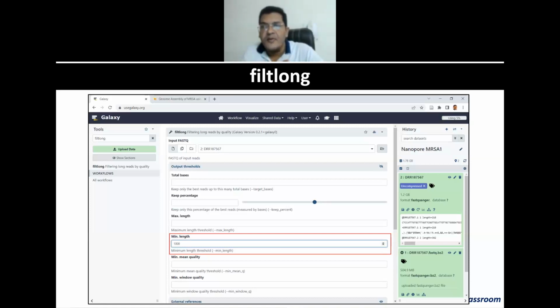But yes, you can look at other examples. You'll be able to see how to upload paired end reads. These anyways would come as two separate files, but you can link them together saying that these two files are from the same fragment. So that then the analysis also gets different. I told you, you can then look for indels and other things because you know what is the fragment length that you have, and what is the fragment length that is coming after you align to a reference, right? And if there is a difference between the two, you know there is an indel there. Remember, we talked of this yesterday.